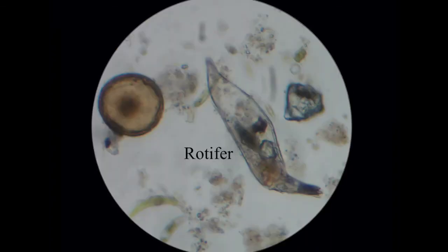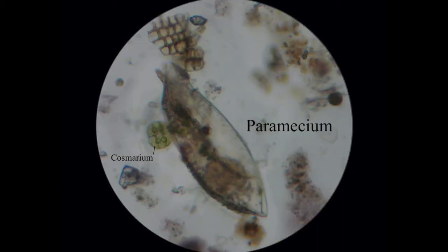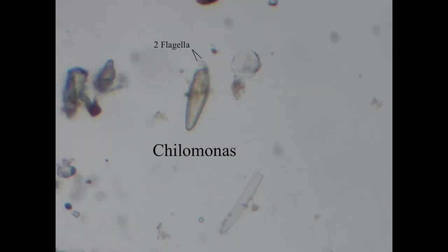This is called a rotifer. I thought it was a paramecium at first because it's a similar shape, but you can see mouth parts at the front. This one is a paramecium — and there's another cosmarium algae there, which is quite a nice view. This is Chilomonas. I quite often get these confused with diatoms under the microscope, but you have to look very carefully and then you see these two flagella at the front that kind of whip around.